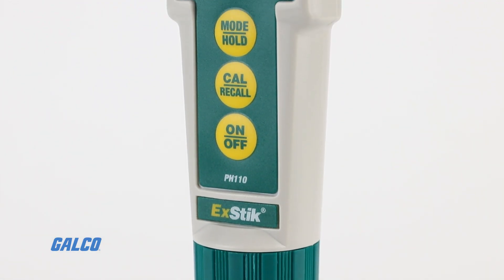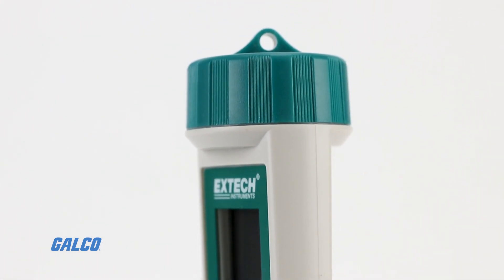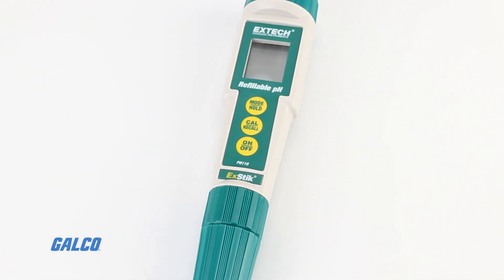This pH meter also features automatic one, two, or three point calibration to recognize different buffer solutions. pH buffers are ordered separately.